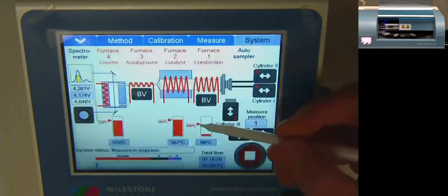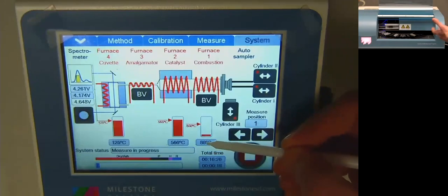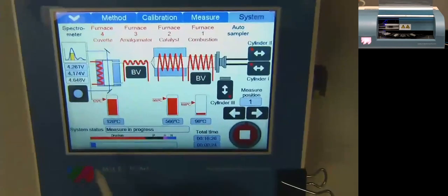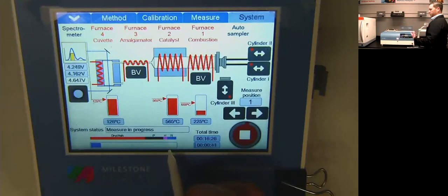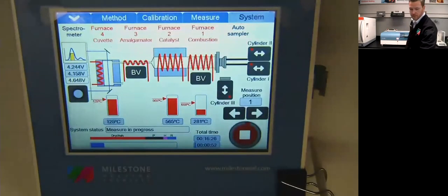Back on the system tab, I can see the set point change to 650°C. It ramps up and then cools back to 250°C before injecting the second boat. There's a load bar showing real time where the sample is: red for drying and ashing, gray 'P' for purge where mercury amalgamates to the gold while carrier gas pushes through matrix interferences, and purple 'H' for the amalgamator heating to 850°C and re-volatizing that mercury, which passes through our AA detector. Those are running — bought myself about 20 minutes.